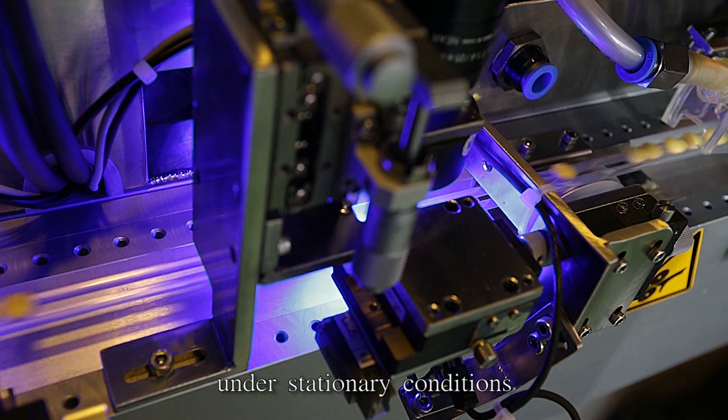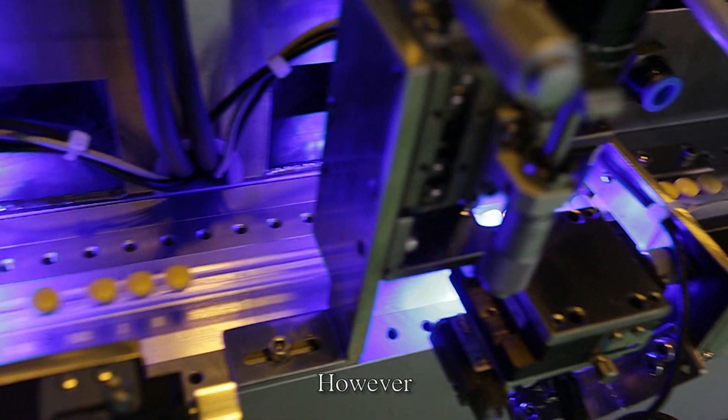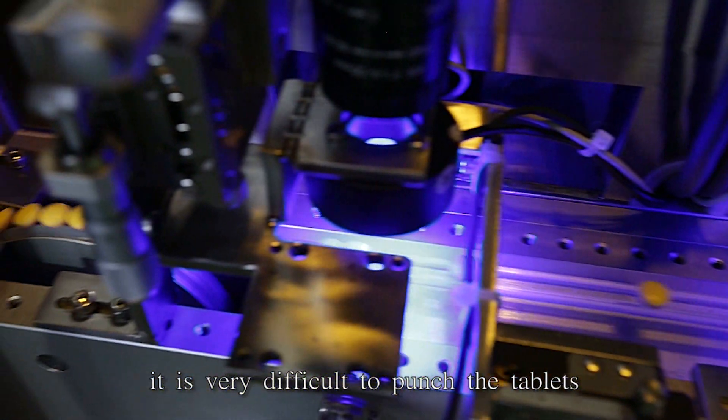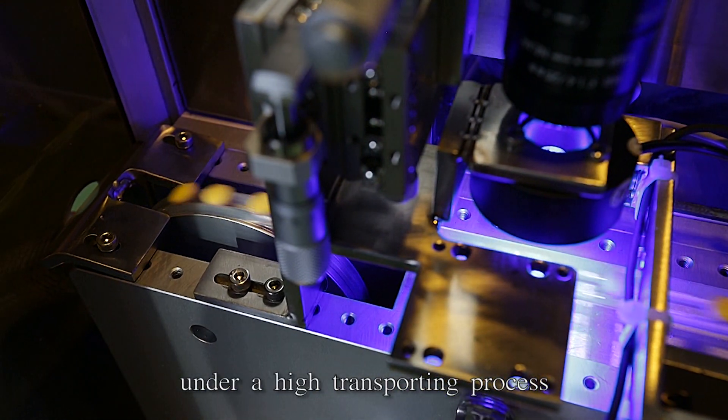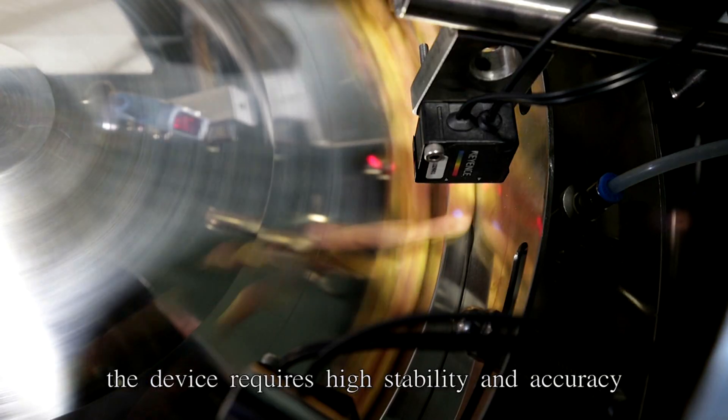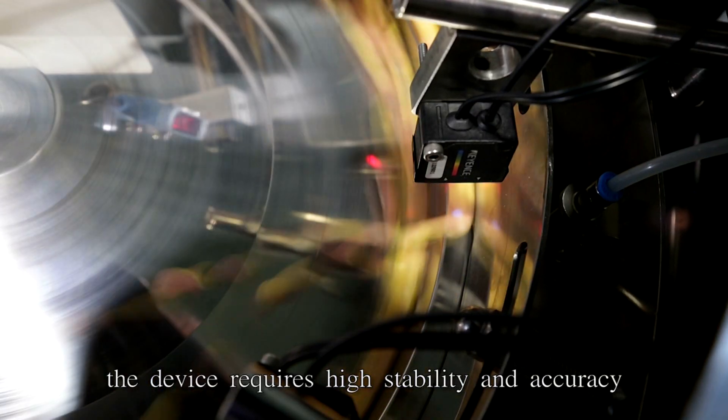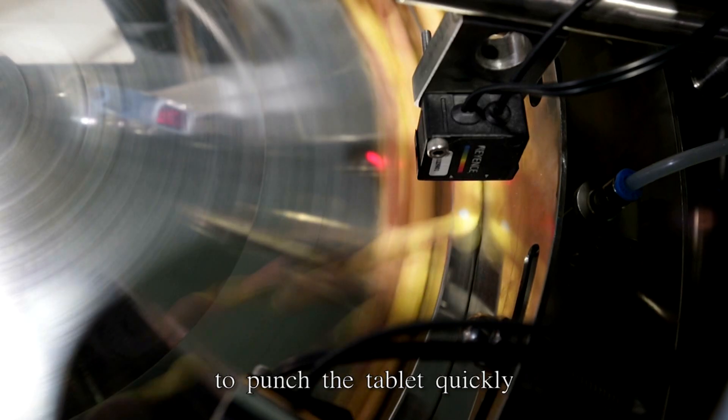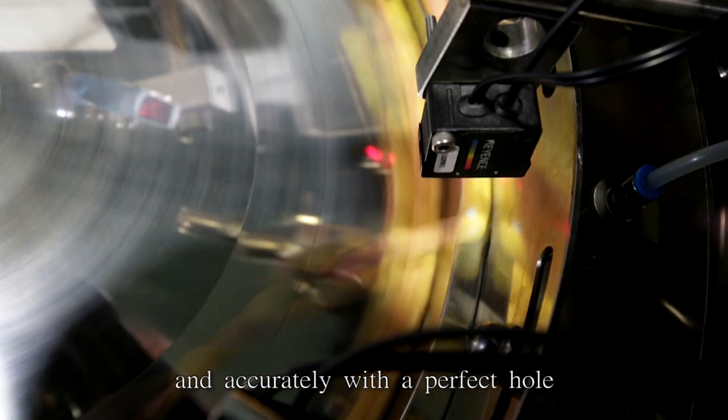It is easy to punch tablets under stationary conditions. However, it is very difficult to punch tablets during a high-speed transporting process. Therefore, the device requires high stability and accuracy to punch the tablet quickly and accurately with a perfect hole.